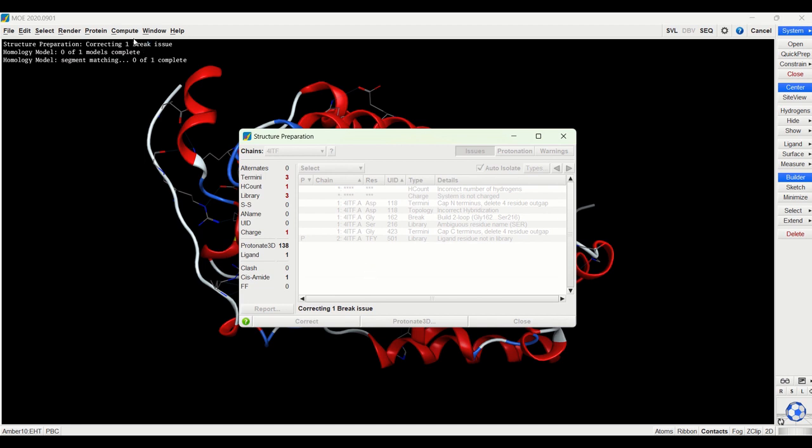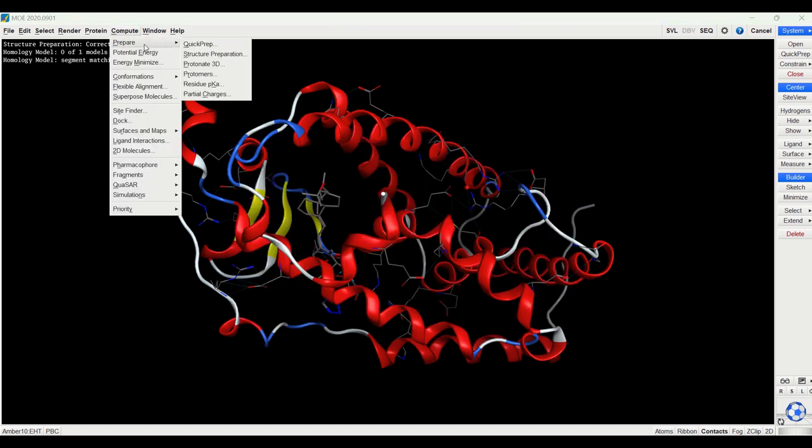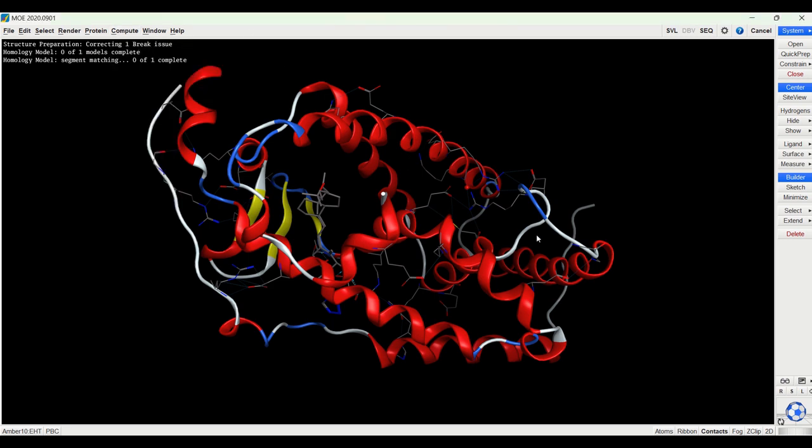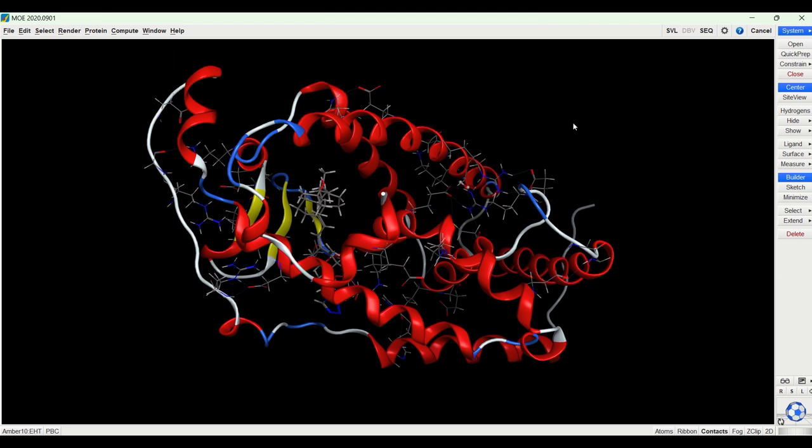Another way to do this would also be to go to compute, repair, and quick prep. You can see it's working up here. Great. Now that it's done, you can see the structure changed a little bit because it added in some implicit hydrogens and other things.